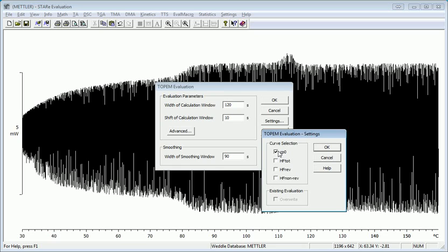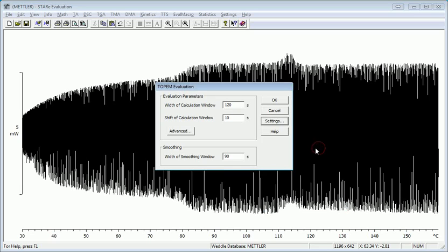Then the heat flow total, reversing, and non-reversing are your options. I'll just leave the heat capacity CP0 on it first. I'm just going to hit OK with the default parameters.